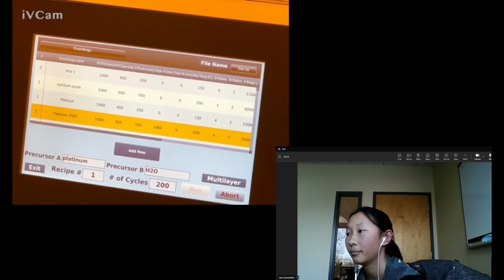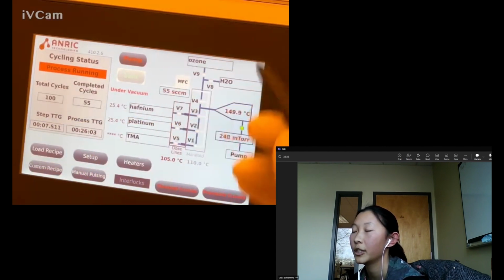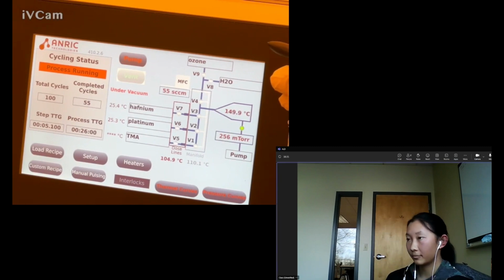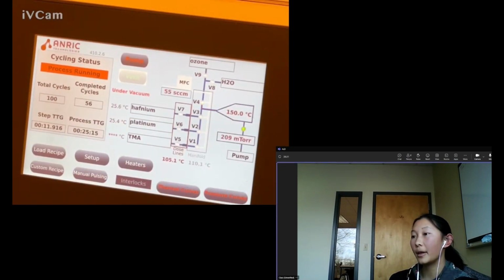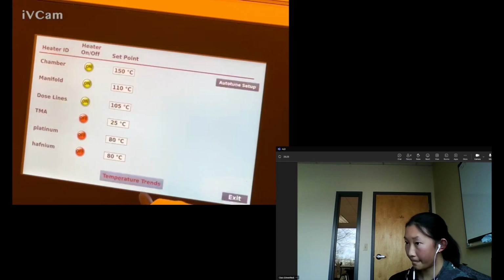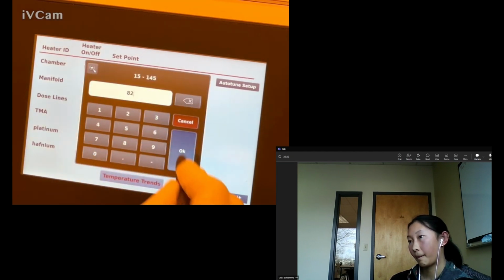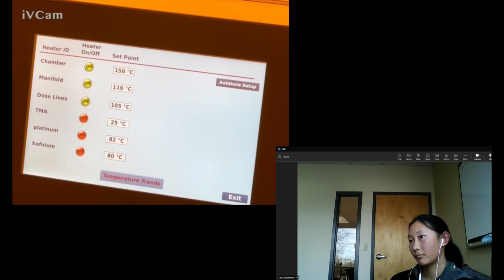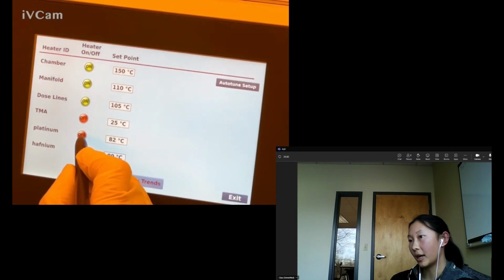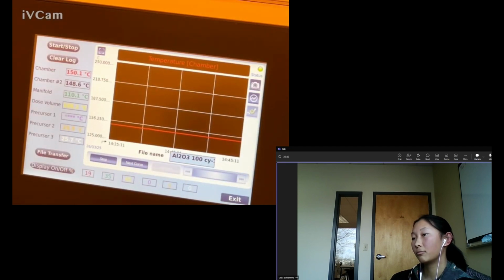You've got 26 more minutes for that. If you wanted to run the platinum today, I would go into the heater screen right now and start warming up that source. Platinum, put it to 82 degrees, and then turn it on, just to start heating up if you're trying to run that today.